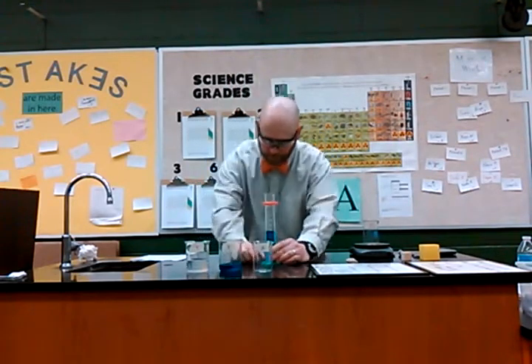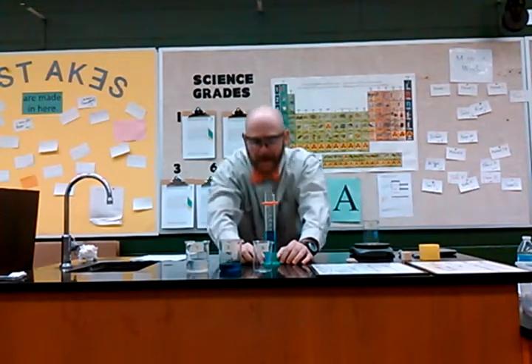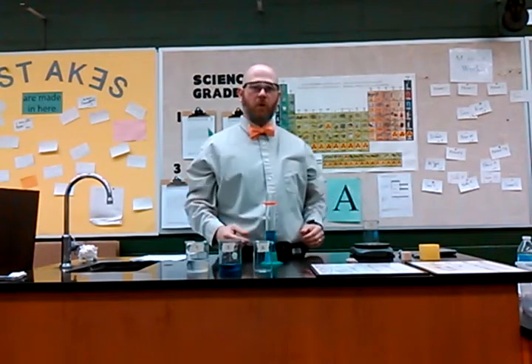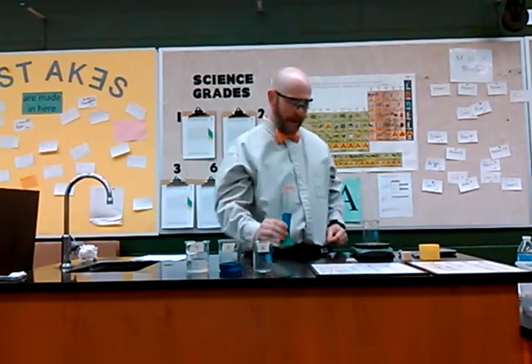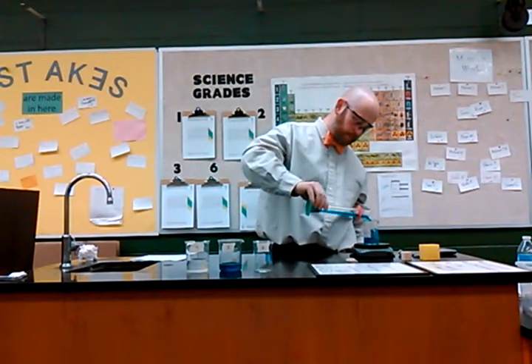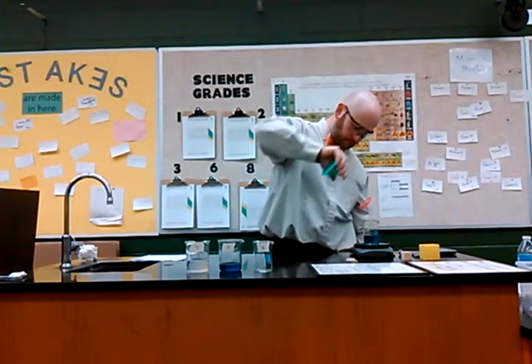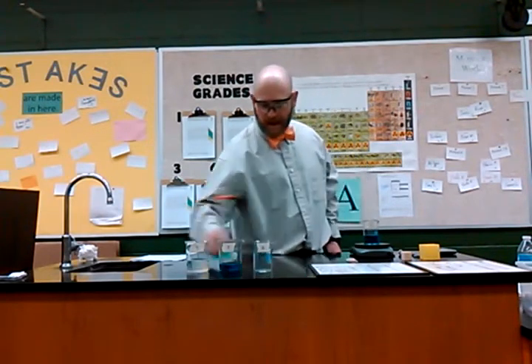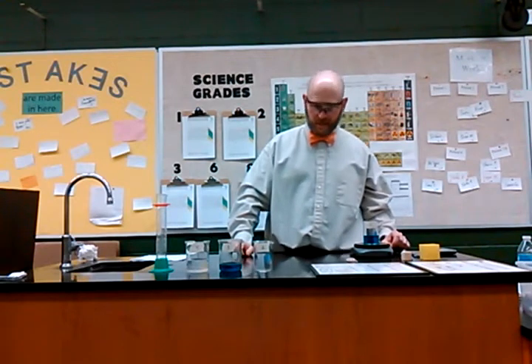In this step, I have 40 milliliters of the water and sugar mixture, or sucrose and water. And when I add those 40 milliliters into beaker 1, this mass is 126.